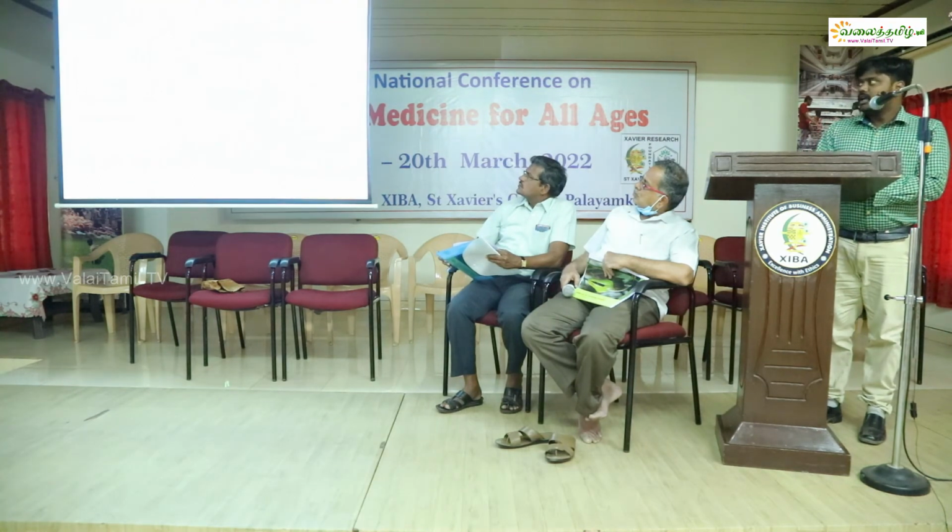Next slide. Other than that, we have the next slide. To estimate the ions, we can go for ICP-OES. The problem with ICP-OES is to develop a method. Without developing a method, once again, detection becomes challenging or very tricky.